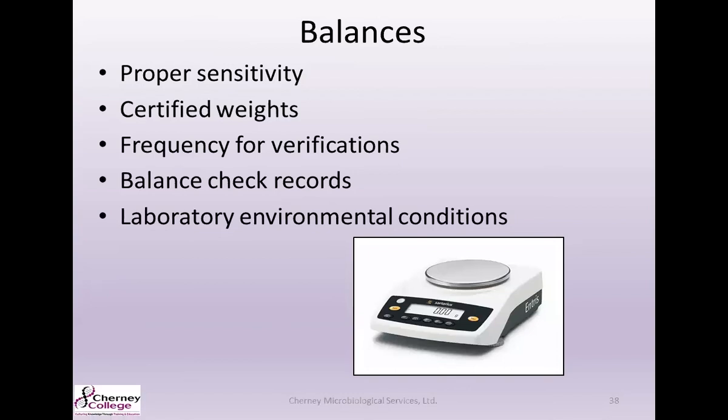When you're using balances in the lab, you'll want to make sure that it has the proper sensitivity. You use certified weights to verify it. You are verifying it frequently enough, and you have accurate balance check records.